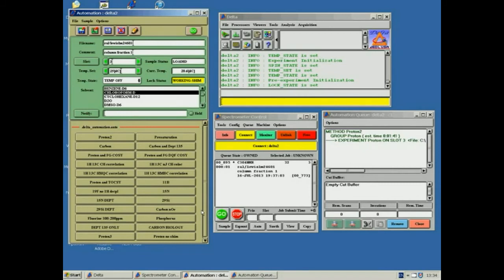The sample has been submitted to the queue and is now being run. If your sample requires more than 30 minutes to run, such as dilute carbon samples, it will be delayed until after 6pm; otherwise it will be added to the queue normally. For this reason, avoid submitting long experiments until late afternoon.